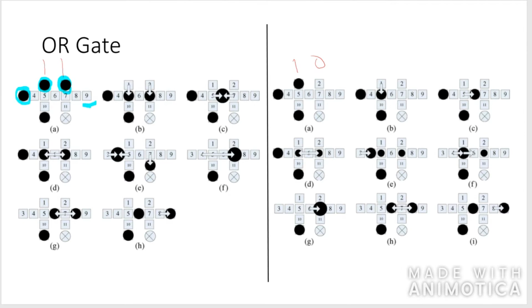This is a reference droplet. This is a waste reservoir. And this is a washing droplet that just clears the gate after it's used. So what happens is the inputs are first diverted into the processing channel. This middle section of the microfluidic design is a processing channel.